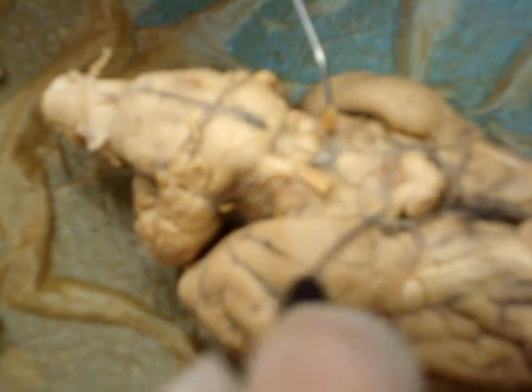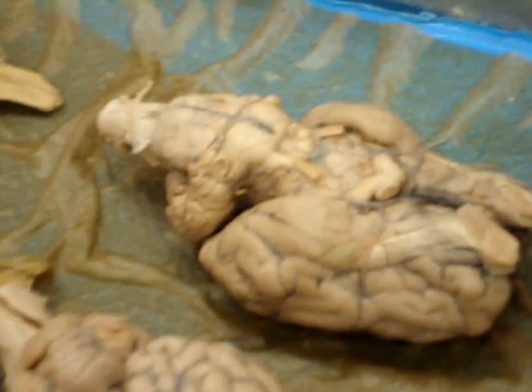Okay, this is the trigeminal nerve. We haven't learned that yet. Okay. Don't confuse us. That's next lab test. We don't need more.